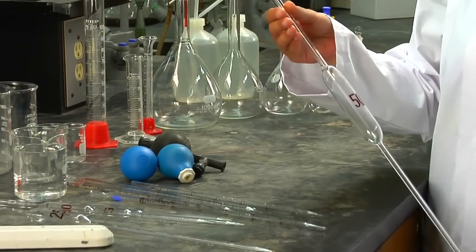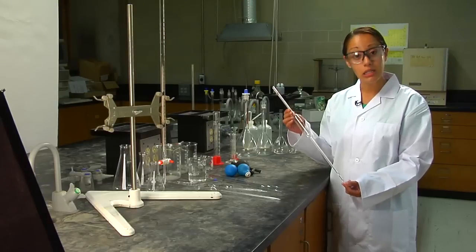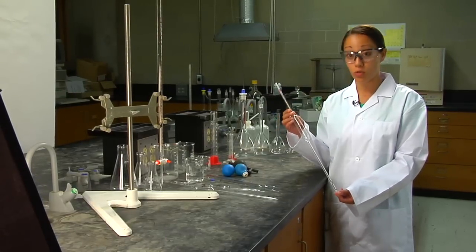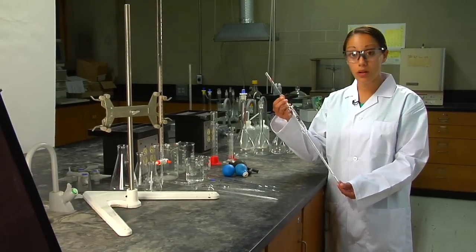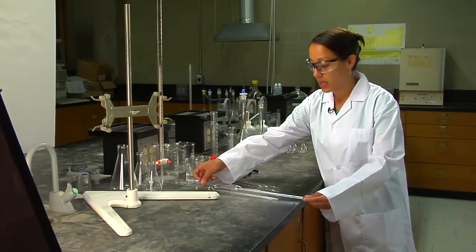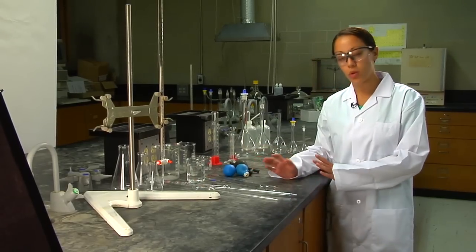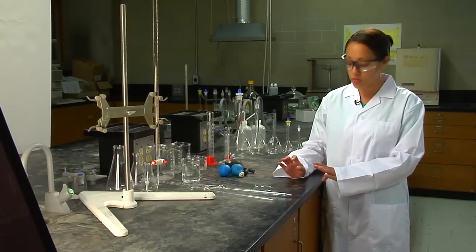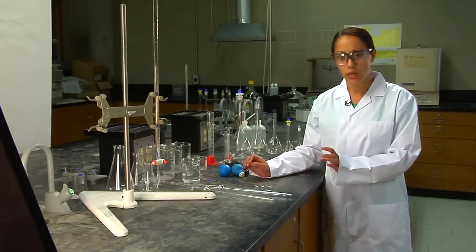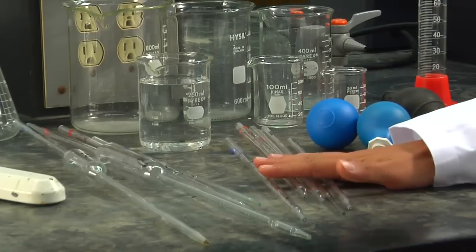The best pipette you can use for making dilutions or standard samples is your transfer pipette because it has one mark and it's very accurate. If you need to measure smaller volumes or more awkward volumes like 2 mL or 5 mL or even 4.5 mL, you also have measuring pipettes.